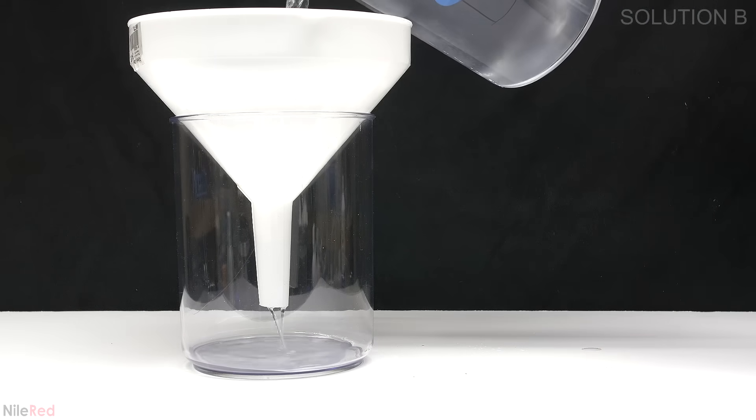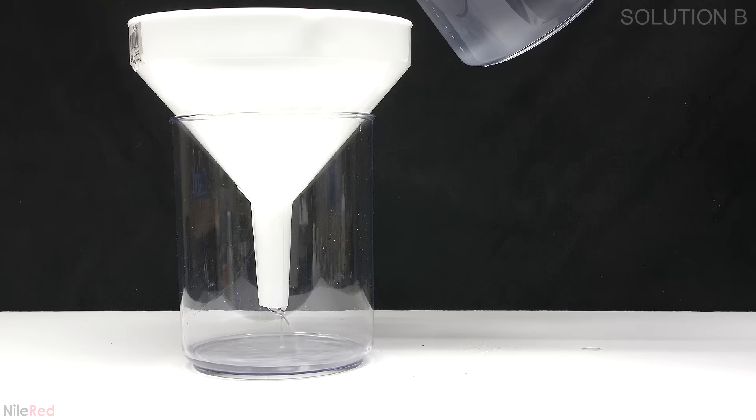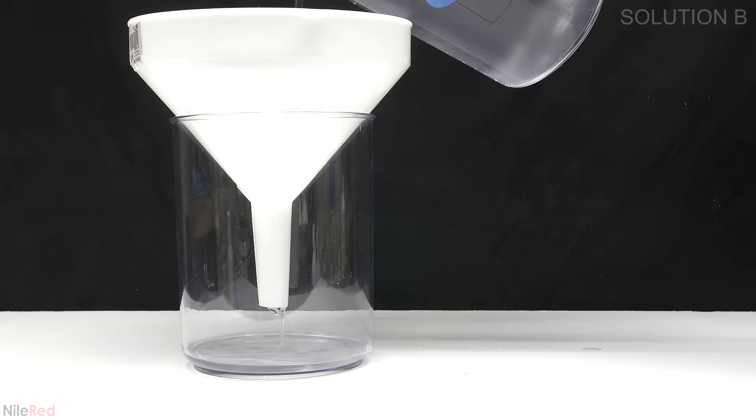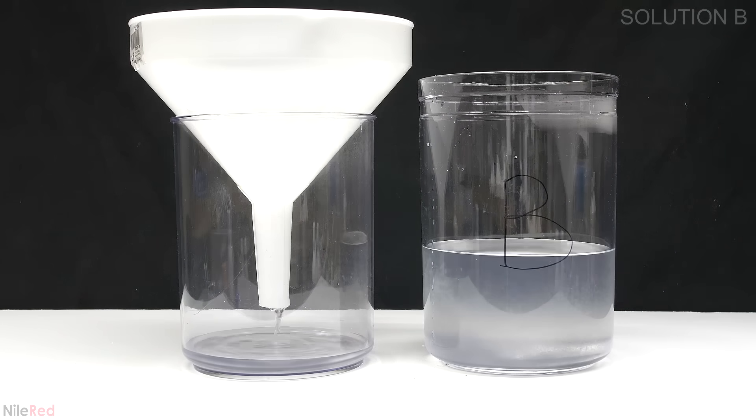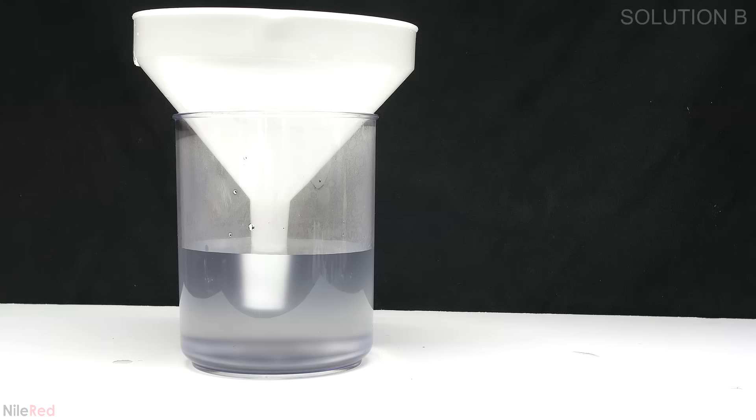Some starches are more soluble than others so depending on the starch that's used this step may or may not be required. What I'm filtering here is still slightly warm and this isn't really a good idea. It does clean up the solution but it's kind of pointless because as it continues to cool more starch is going to precipitate out.